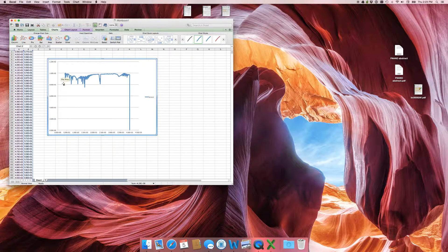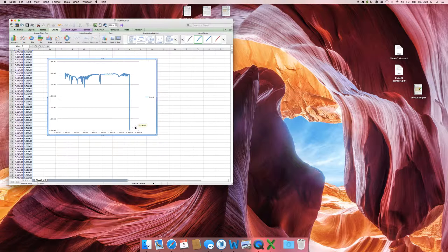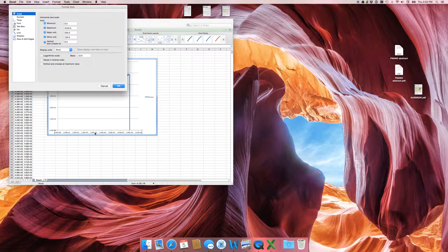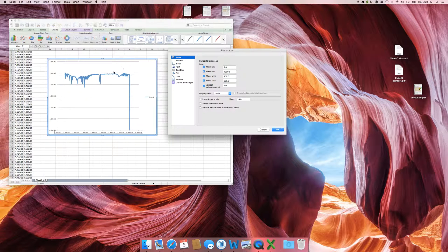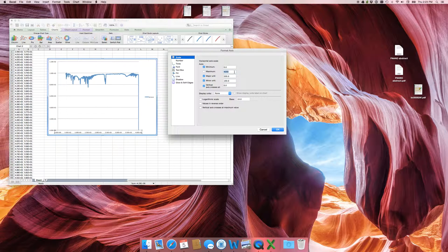We need it to look like an infrared spectrum. The first thing to notice is there's no reason to have this giant peak out at 4,000. We need to start formatting this axis. The useful data probably ends somewhere around 3,800, so let's set the maximum to 3,800.